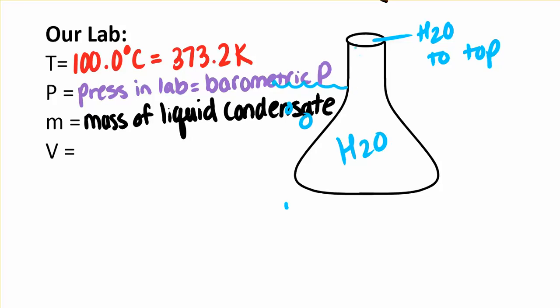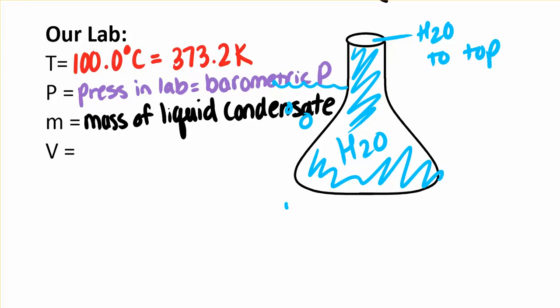And so you want that water to occupy the entire space of your flask. Then you will take the mass of the water. You'll have the mass of your unknown flask, and you'll be able to determine the mass of water. So say that 267.17 grams of water fit in your flask. Well, how many milliliters of water is that?